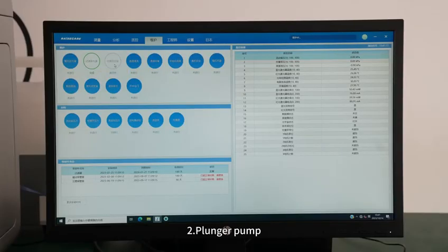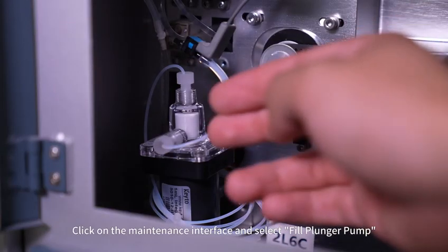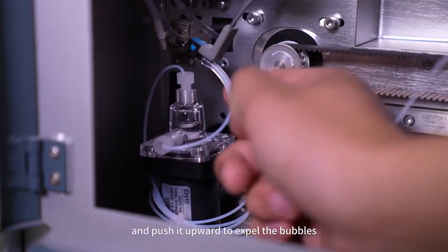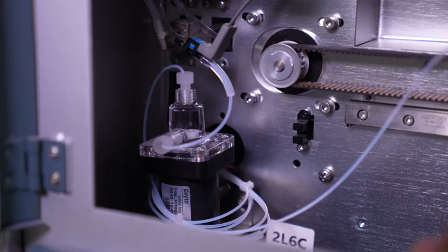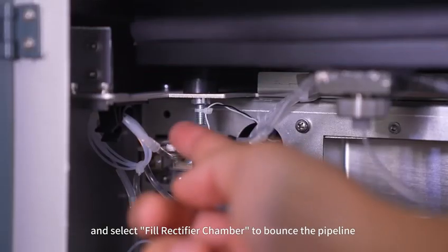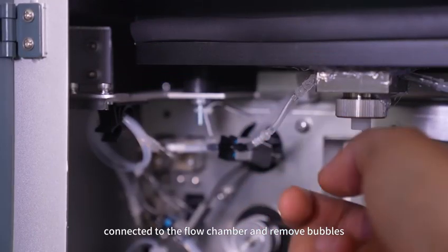Second, plunger pump. Click on the maintenance interface and select Fill Plunger Pump. When the plunger pump is sucking downward, shake it and push it upward to expel the bubbles. Gently tap the pipeline to remove bubbles. Third, rectifier chamber. Click on the maintenance interface and select Fill Rectifier Chamber to bounce the pipeline connected to the flow chamber and remove bubbles.